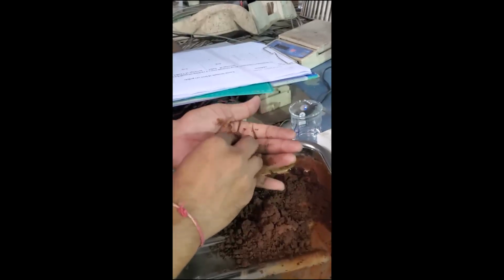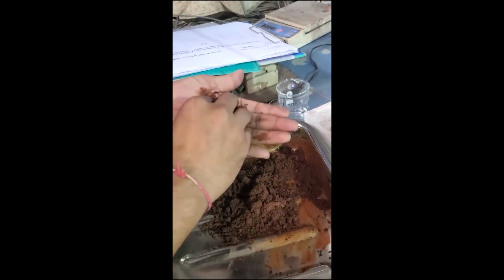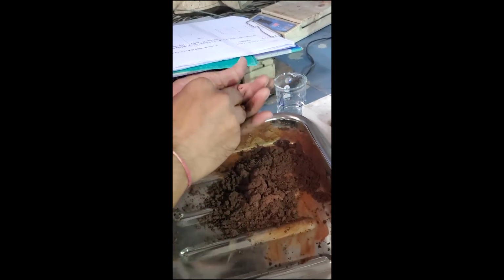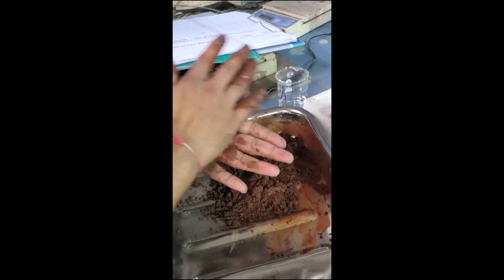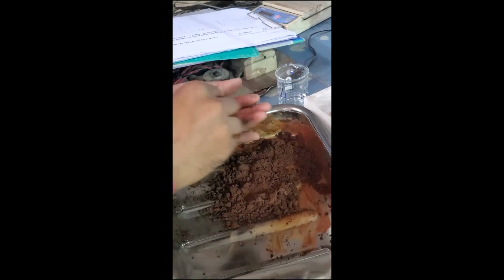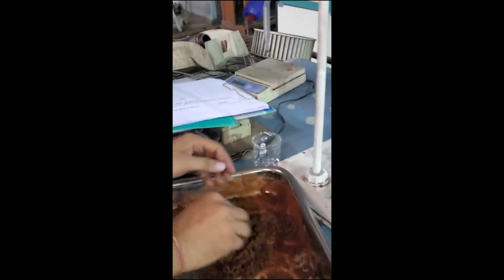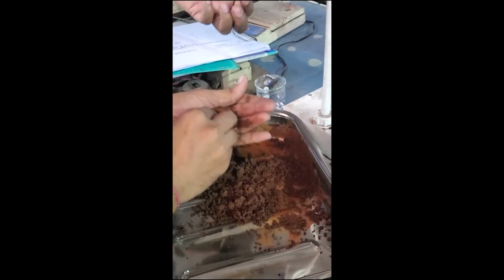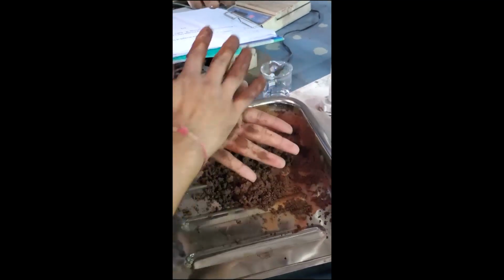Now we are making the pellet. The mix is ready to bond. So proportionately that water is mixed, that's why the pellet is formed. So in this mix, binder is not there, only iron ore and water is there. That's why it is a little difficult to make the pellet. So now we are making the pellet.